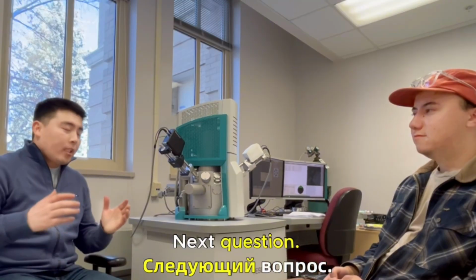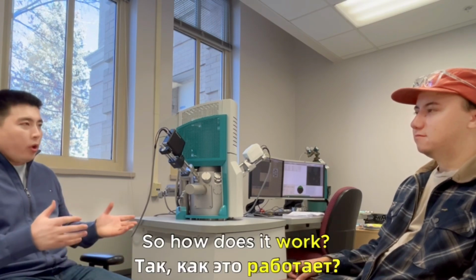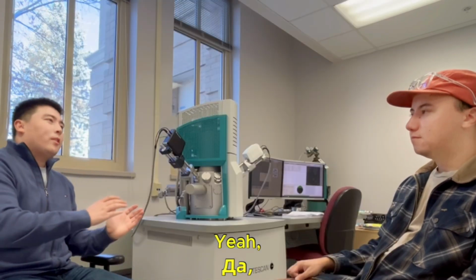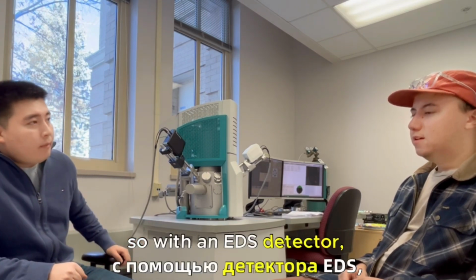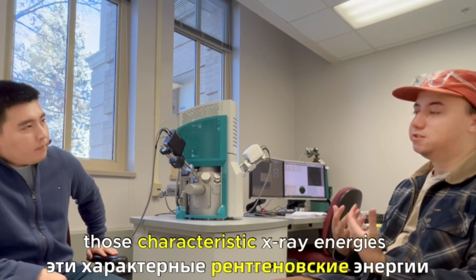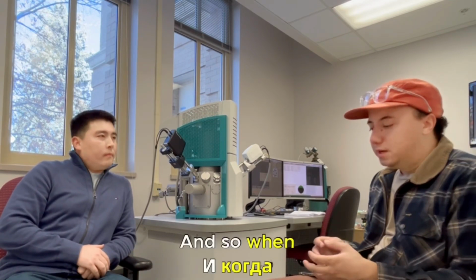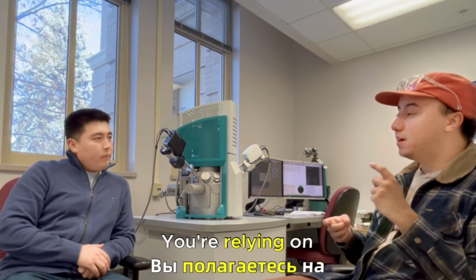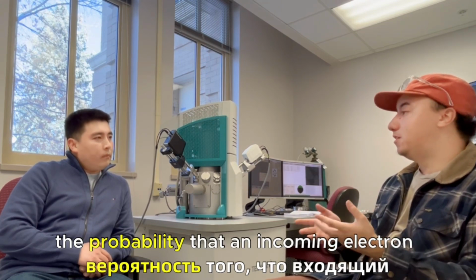Next question. Let's talk about the EDS detector. So how does it look? It gives spectra of the elements. Some elements come out earlier than other elements. Why is that? Yeah, with an EDS detector, you're looking at those characteristic X-ray energies produced by the electron beam interacting with the atoms of the sample. When you have that happening, you have a few different things that you're relying on. You're relying on statistics, or probability, I guess is a better way to put it.